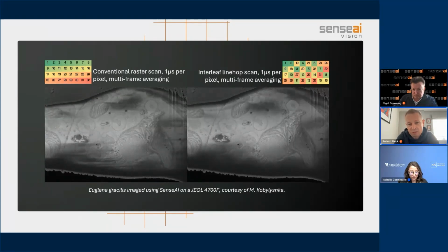And we've managed to do this with a Chlorella vulgaris study, where the group we were working with were mutating it to change its color. They were intending to reduce its reliance on photosynthetic growth and move it to a heterotrophic growth condition, and in turn change the lipid droplet concentration within the cells. And Volume EM proved to be extremely efficient and effective at quantitatively measuring these changes during mutation.